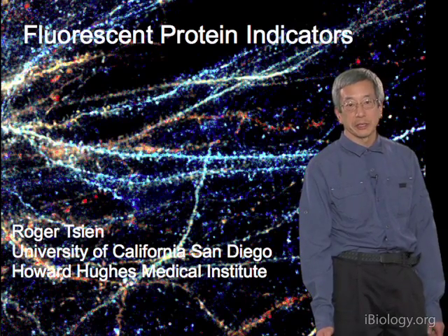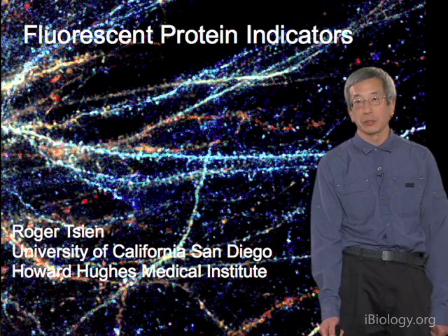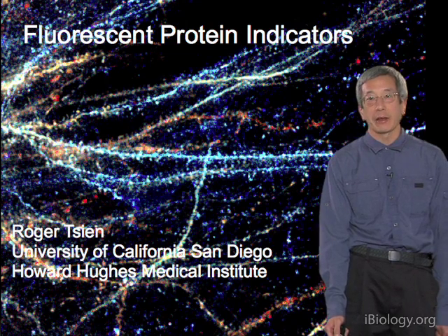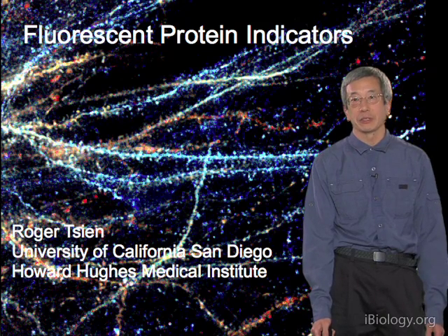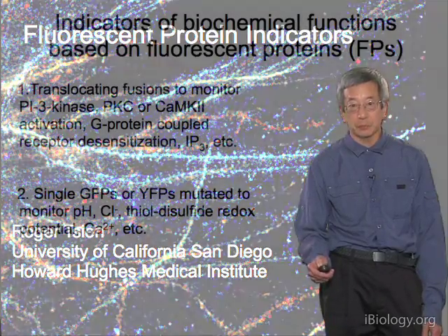Okay, I'm Roger Tsien, and today I'm going to talk to you about fluorescent protein indicators. In other words, molecules that have been engineered out of fluorescent proteins to then report to us crucial biochemical signals, especially their dynamics and spatial localization inside cells.